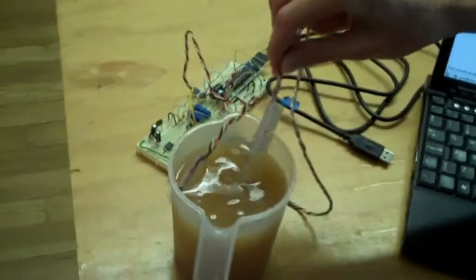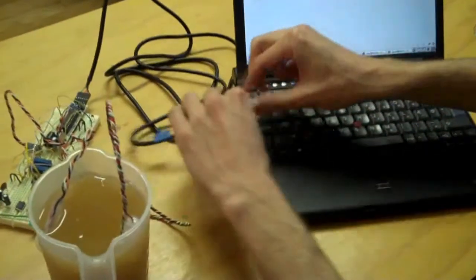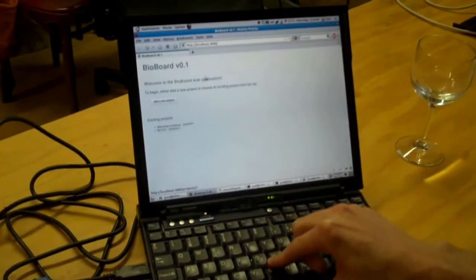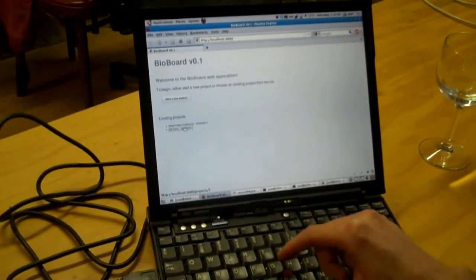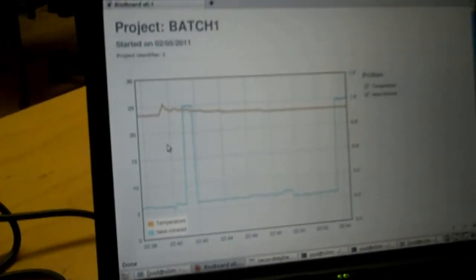Hi, my name is Joel, and I did the PC software for the BioBoard project. We wanted to be able to log all the data coming in from these probes and also put it on a library to see. We did a two-part piece of software: a logging daemon that takes in all the data and puts it in a database, and a web server that shows all the data in an online graph. Here we have the BioBoard logged in to our probes — you can see it's measuring some Kombucha with a temperature and an infrared probe. To log this and show it in graphs, you just plug the USB cable into your computer. There's also an option to use an Ethernet shield if you want to do it over the internet. Then you go to the web server software, click on the project, and it will show the graphs for the data — temperature and near-infrared — so you can see what's happening in your fermentation.